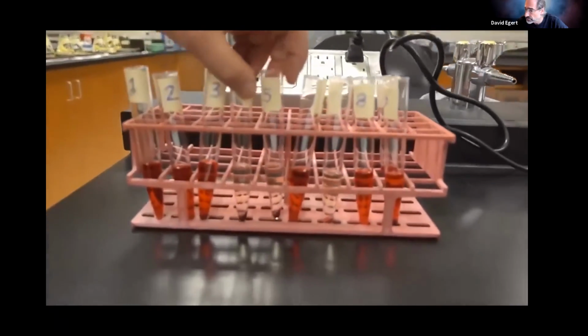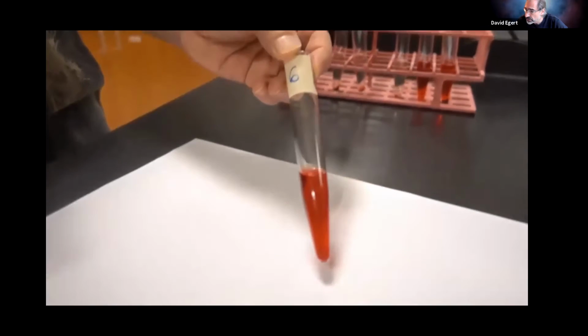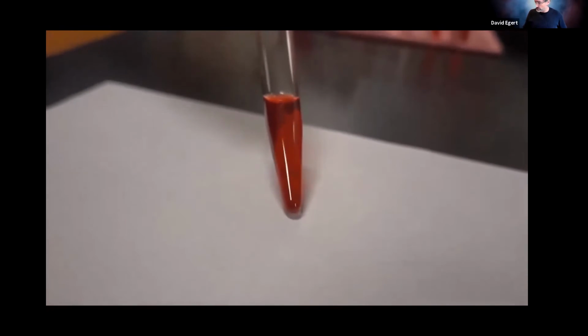All right, so test tube 6, this is the ammonium chloride. You can see we have no pellet. All the cells seem to be lysed, and the hemoglobin dissolved in the supernatant. This one's a tricky one. We'll talk a little more later about what happened here. This one's not so intuitive. It very likely did not follow your hypothesis, which again is all right. Hypothesis does not have to be correct.